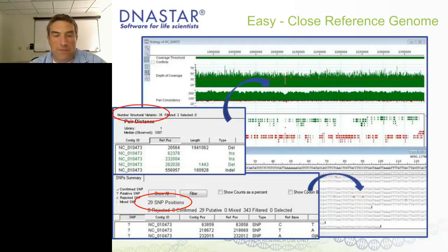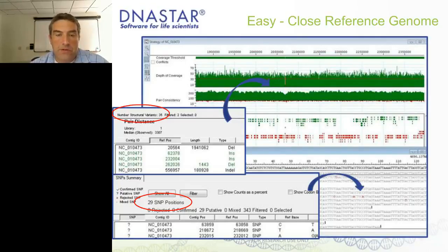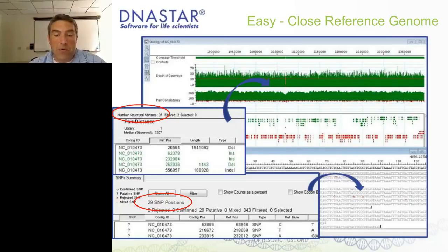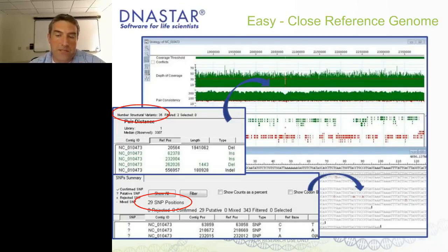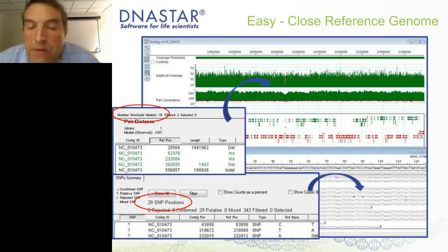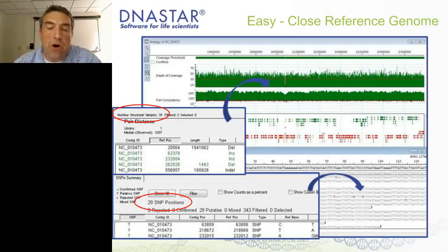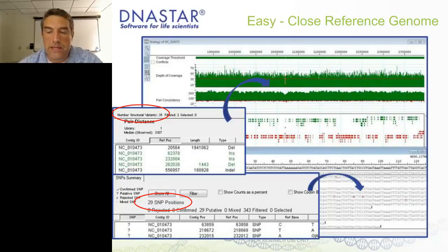The structural variation report shows 35 structural variations total in the whole genome — a relatively small number. The SNP report shows 29 SNP positions. With 29 SNPs across a five-megabase genome, these genomes are very, very close together. So I can quickly assess and say, if I want to produce my new genome, all I have to do is export a consensus sequence and begin annotation work. This is showing the easiest case.